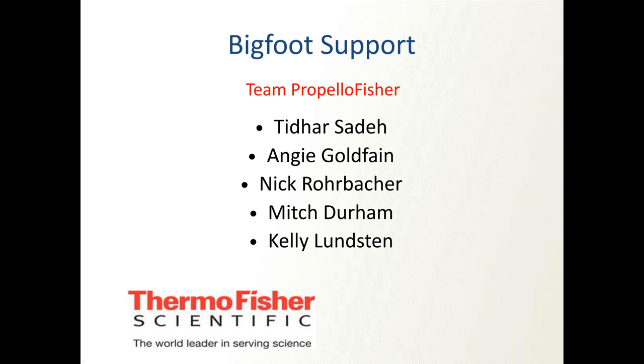And that's what we're doing now. Like I said, we've hit on that 11 color. And I think the next step would be iterative panel building. To a certain point, you're going to be able to get to what works best on both machines before you have to start bifurcating into adding this color will work better on this machine or that color on the other machine. And I can tell you right now, probably at 15 or 20 colors, you're going to start seeing a panel work better for one or the other.